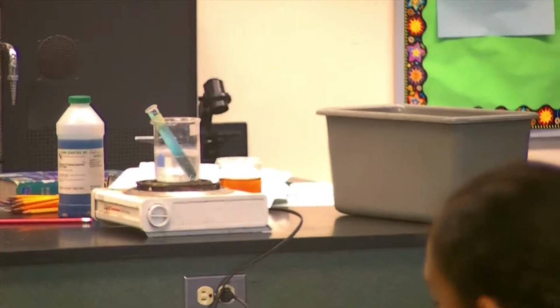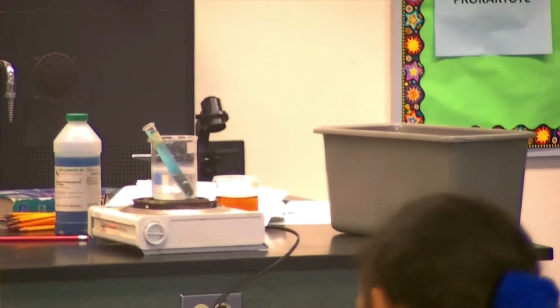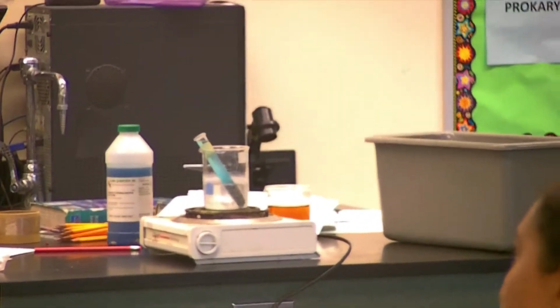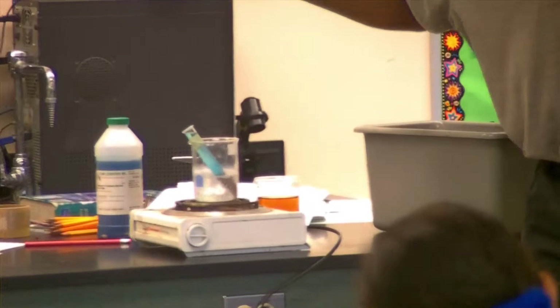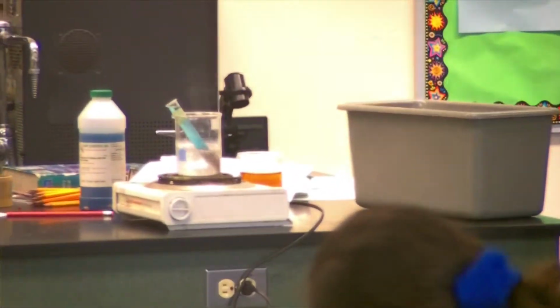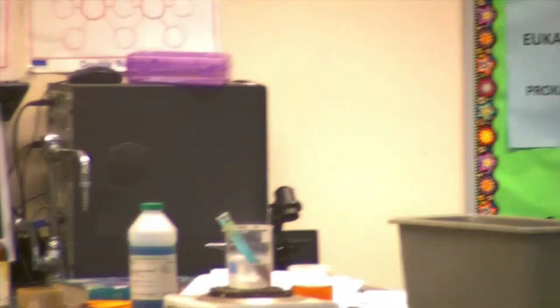Okay, what's the evidence? That should turn what? Carrot orange. Okay? Did sugar move out? Yes. What's our evidence? The solution here should turn. You can kind of see it almost getting there. Slowly but surely, it's getting there. Let it sit a little bit longer. And that's our evidence, that it should turn what color? Carrot orange. Okay, that's how you fill up the last box there.